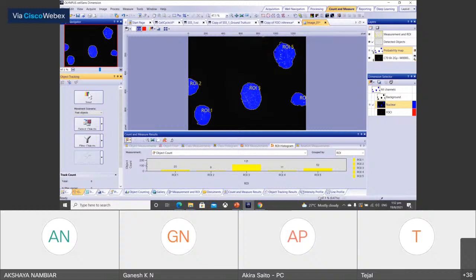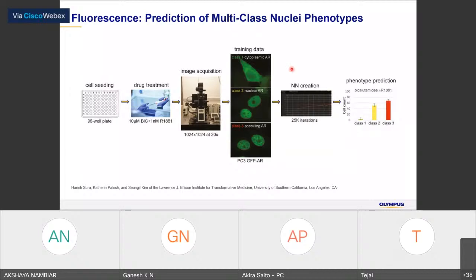That needs to be set in the algorithm, and then if you click start, it will give you the result of the tracking.